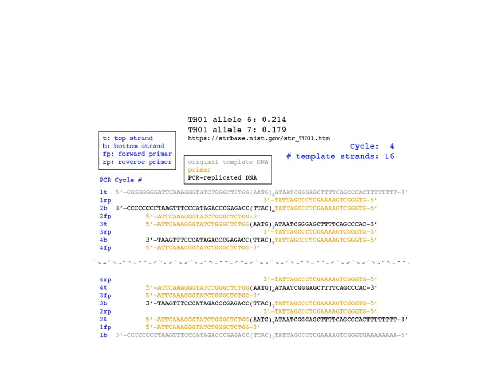And here we are. So back to this. Take a minute, please, maybe 3, depends on how long it takes, because it's just counting nucleotides. We need to figure out, remember, this individual is a heterozygote. They had an allele 6 at TH1 and an allele 7 at TH1.